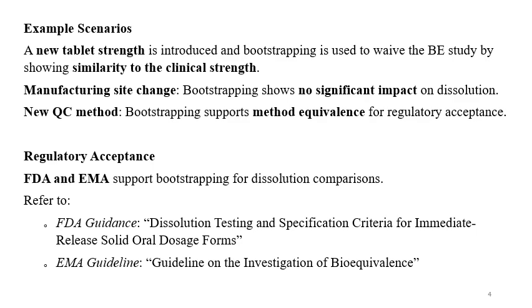Bootstrapping shows no significant impact on dissolution or new QC method. Bootstrapping supports method equivalence for the regulatory acceptance. But generally, the bootstrapping calculation is used to demonstrate the dissolution similarity when there is a high variation in the dissolution profile. Regulatory acceptance: FDA and EMA support bootstrapping for dissolution comparisons.